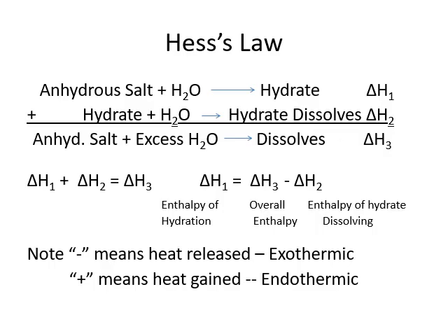In this experiment, our goal is to figure out the amount of heat that the reaction gives off or absorbs for an anhydrous salt adding just the right amount of water in order to form the hydrated complex. So we're taking magnesium sulfate and adding 7 water molecules to form magnesium sulfate heptahydrate. That is delta H1.